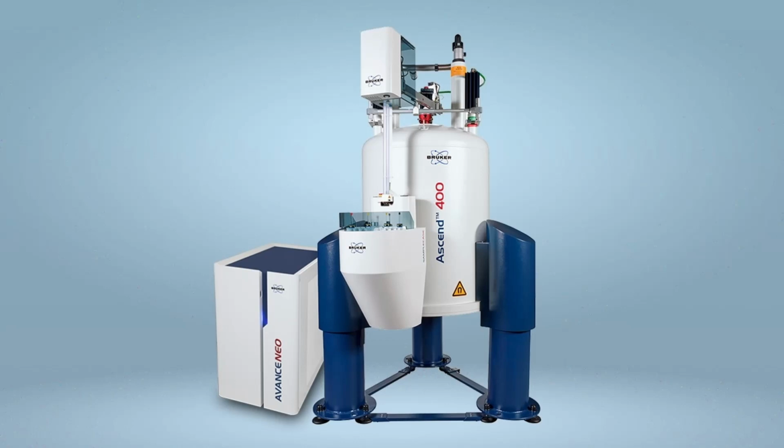The Earth's magnetic field has a field strength of between 30 and 60 microtesla. A typical magnet used in an NMR machine has a field strength of between 2 and 10 Tesla, some 10 to the power of 5 times stronger than the Earth's field. These magnets are dangerous, and no metal objects must be taken into the rooms where they are. There are many stories about unwitting workers whose metal toolboxes have become firmly attached to NMR magnets.